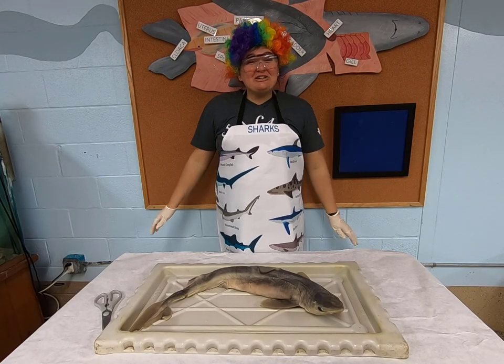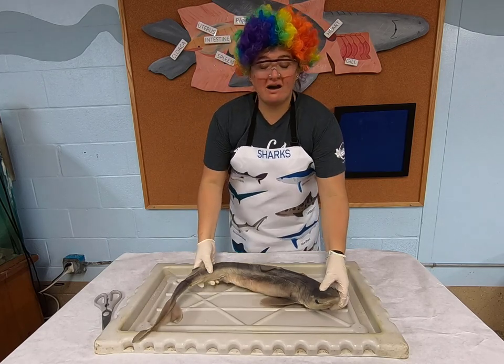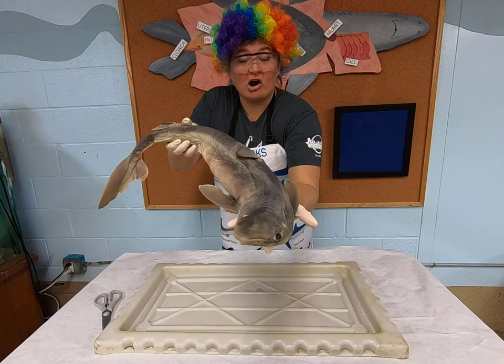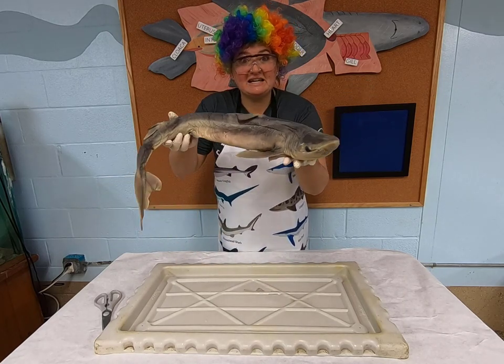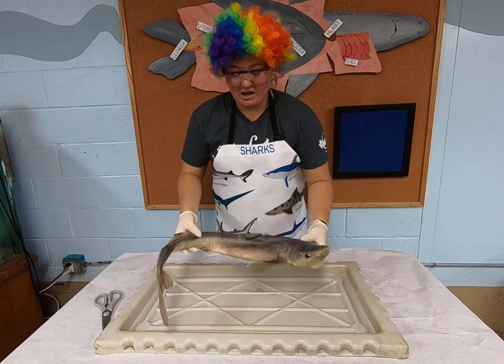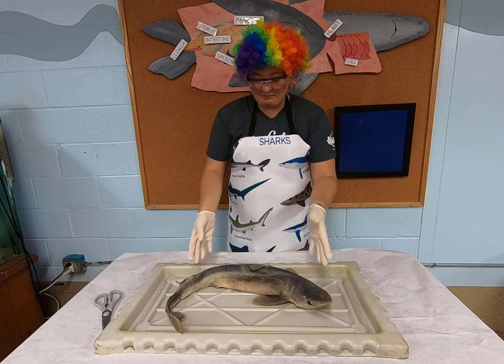Everybody. Today we're gonna do a spiny dogfish dissection. We're doing a spiny dogfish dissection because spiny dogfish are a marketed shark in the fishing industry, and there's a lot of them, and we get to dissect them to learn a little bit more about them. They're called the spiny dogfish shark because they do have spines.